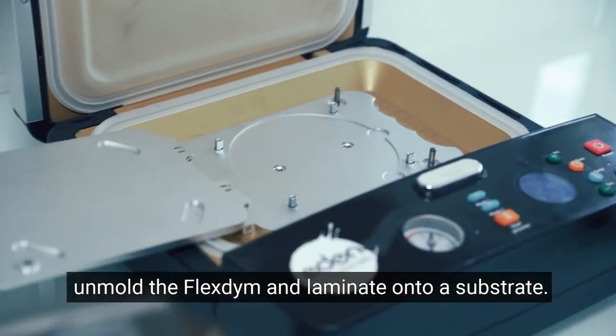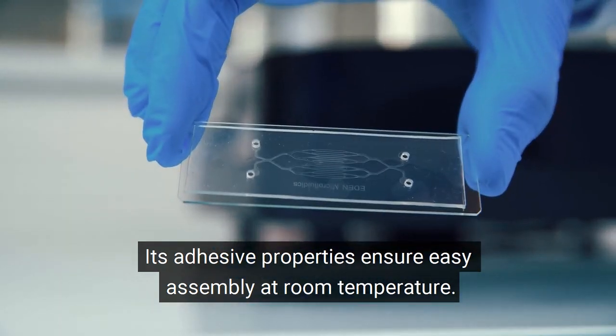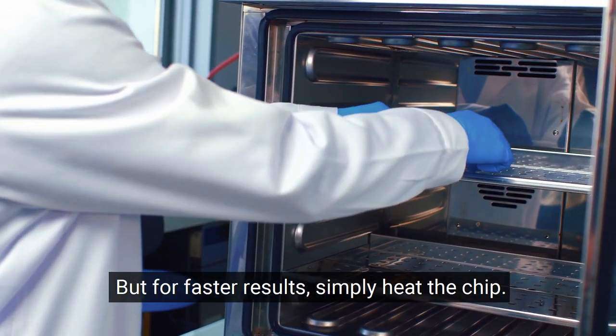Finally, unmold the Flexdym and laminate onto a substrate. Its adhesive properties ensure easy assembly at room temperature. But for faster results, simply heat the chip.